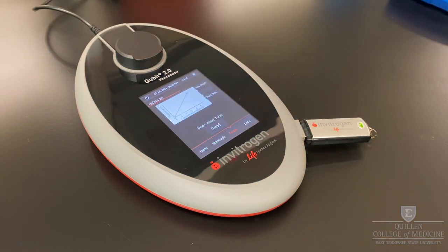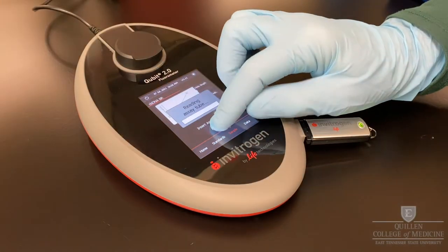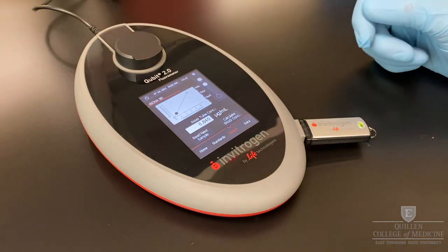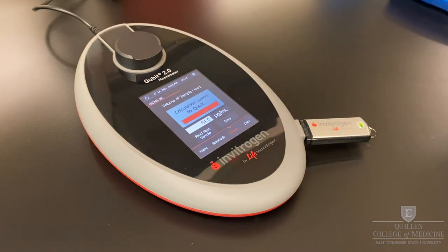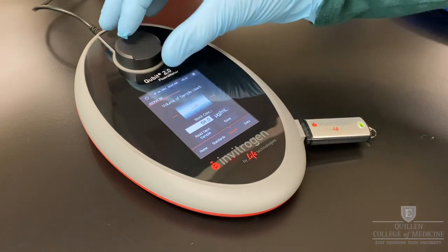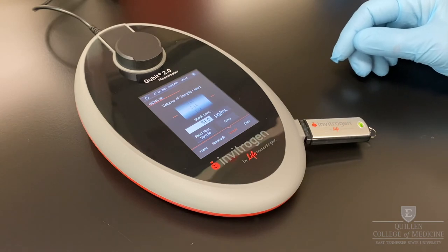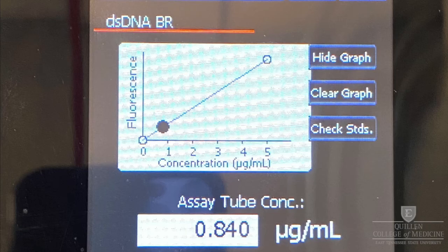You're now ready to begin reading each of your samples. Insert your first sample and press read. To calculate your stock concentration, select calculate stock concentration, adjust the volume of sample used, and save the calculation. You can continue reading samples by pressing read next sample. The fluorescent absorbance of your sample is plotted on the 2-point standard curve. The assay tube concentration does not take into account your dilution factor, so be sure to use the calculate function.